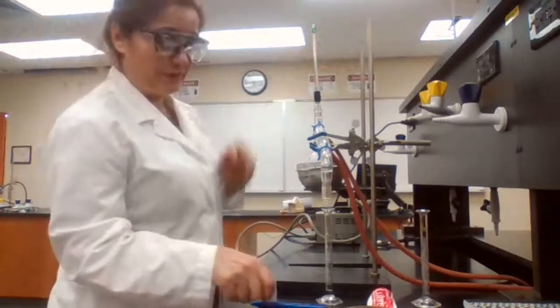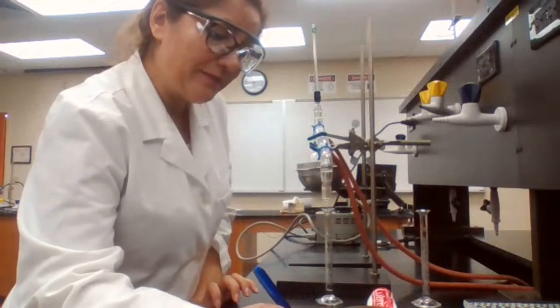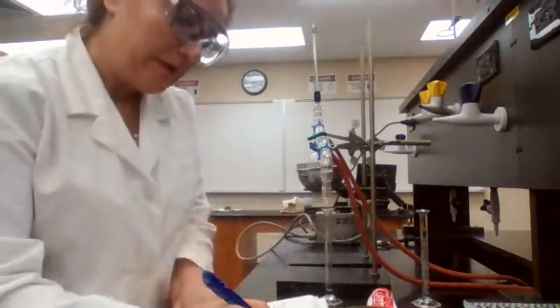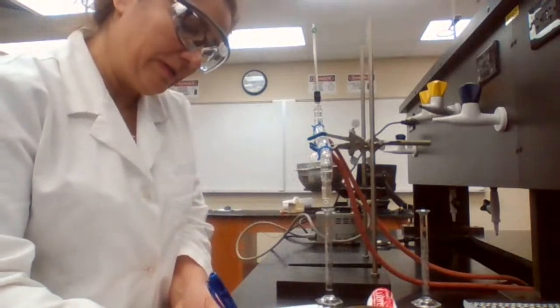1 milliliter, 55. At 1 milliliter would be 55 degrees Celsius. So record the number. For 1 milliliter, 55.